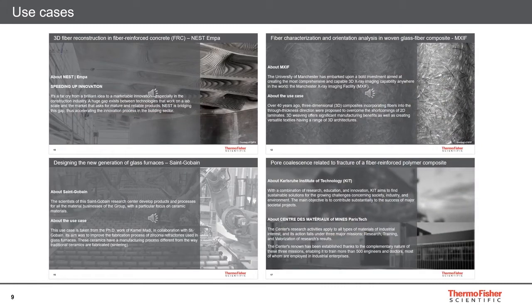The upcoming slides will highlight some partners' use cases: 3D fiber reconstruction in fiber reinforced concrete or FRC, fiber characterization and orientation analysis in woven glass fiber composite, new generation design of glass furnace and pore coalescence related to fracture of a fiber-reinforced polymer composite.